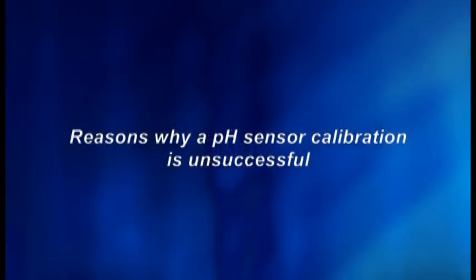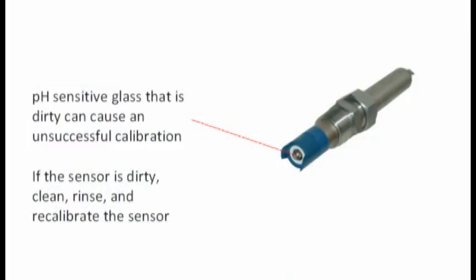If the calibration was unsuccessful, the sensor may need to be recalibrated or replaced. There are a few reasons why a pH sensor will not calibrate, causing the instrument to show an error message. First, the pH-sensitive glass is dirty. Cleaning the pH sensor may resolve the problem. In this case, clean, rinse, and recalibrate the sensor.